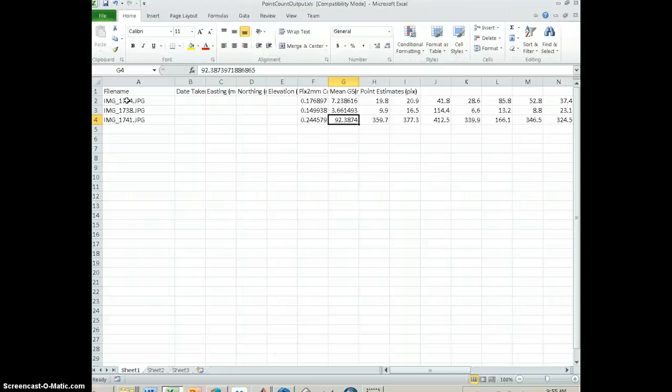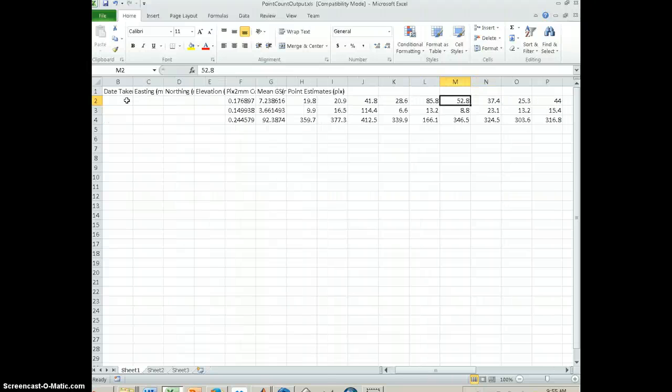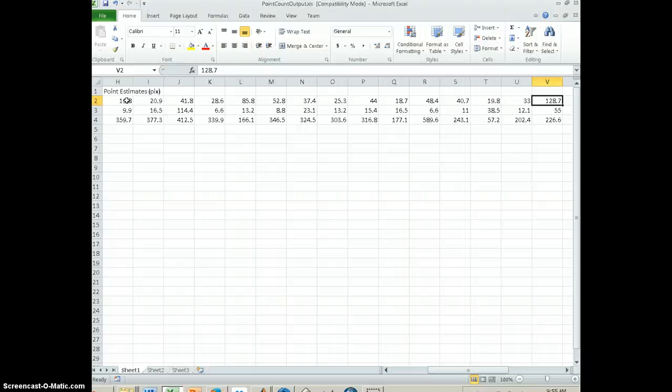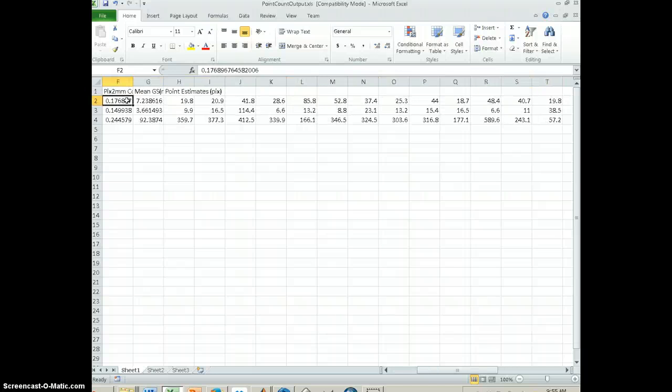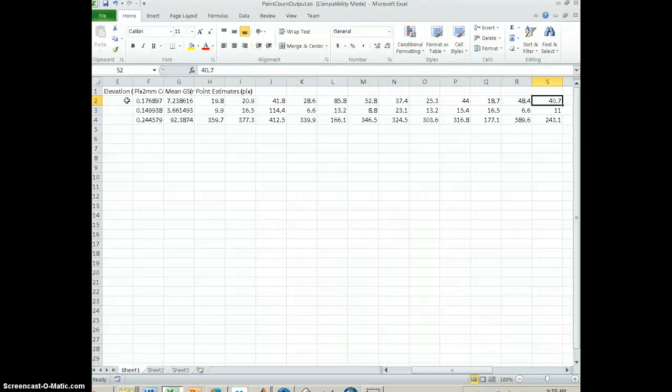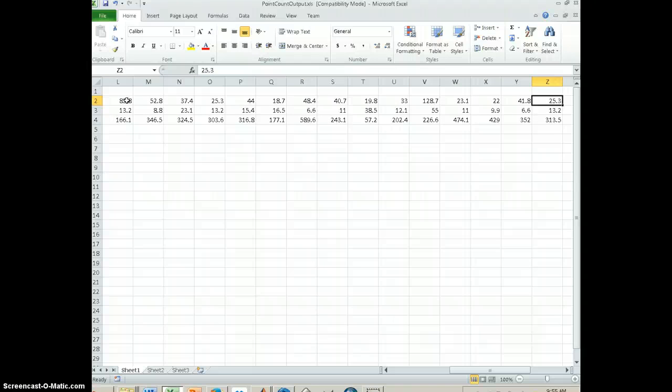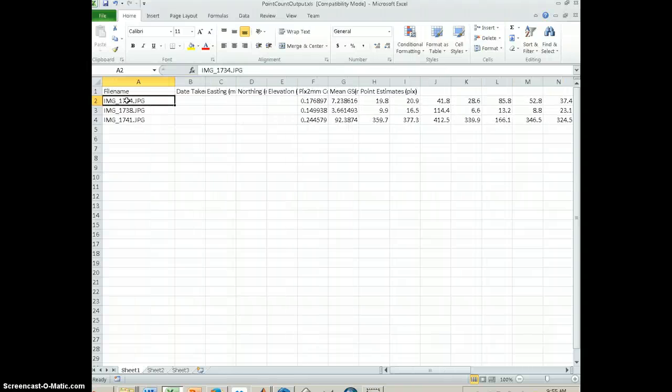And then the next 25 columns are basically the individual estimates of grain size in pixels from your photographs. And so these are your raw measurements that you made with that point count tool. So that is how to use this tool.